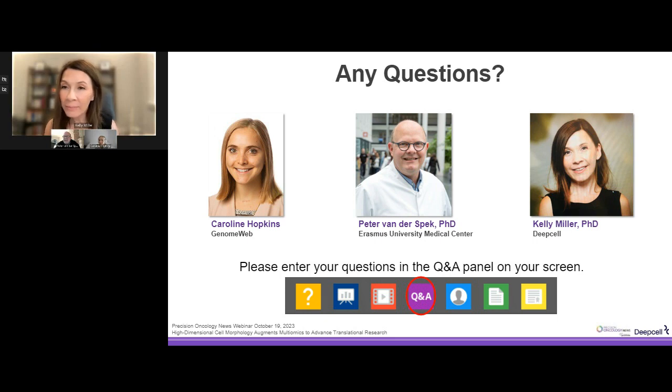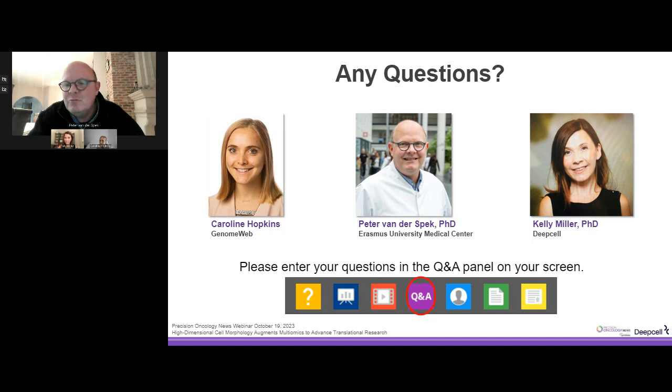So we are very excited that it's pretty fast to make these UMAPs. We typically take a day or a day and a half, but then you already have a very good feel about your whole experiment. So there's definitely a gain in time versus conventional technologies that we had to apply to come to certain conclusions.